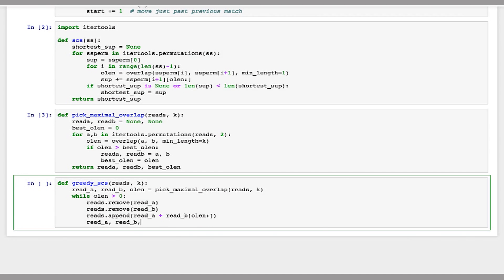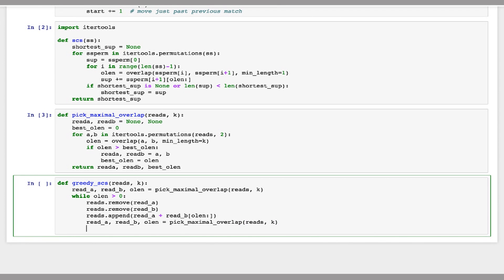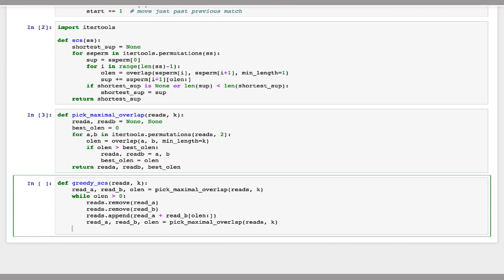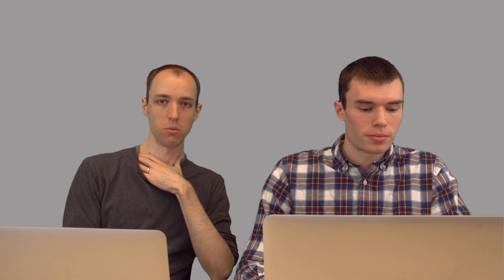So now I just need to recalculate the new a, b, and overlap length with the greatest overlap. And when this is done, so the remaining reads when we're done this will be all of the reads that don't have any overlap. So in this case, we can just join them all together, it doesn't matter. And this will be our shortest common superstring.